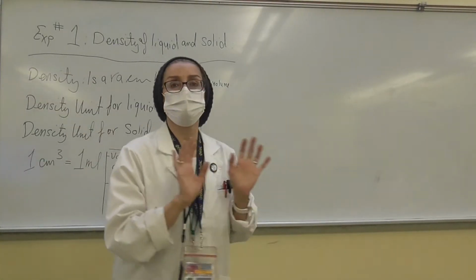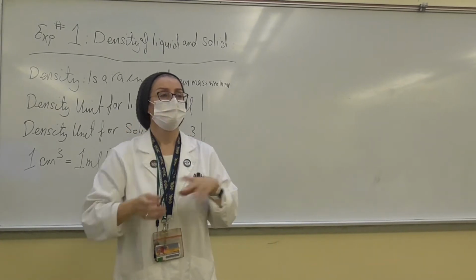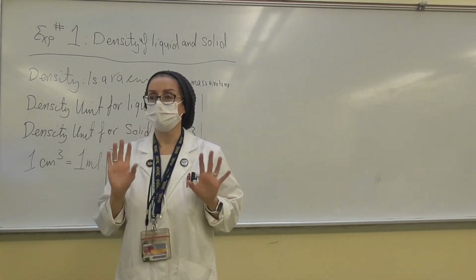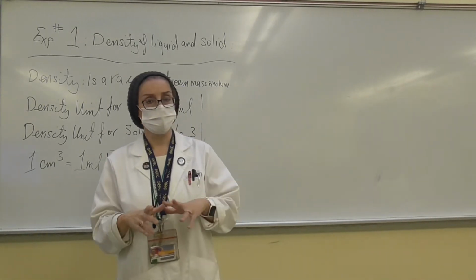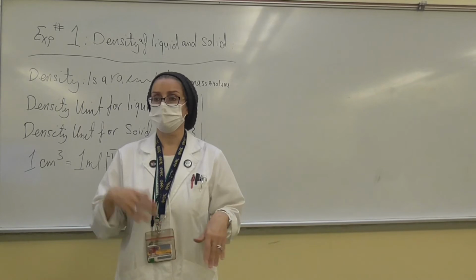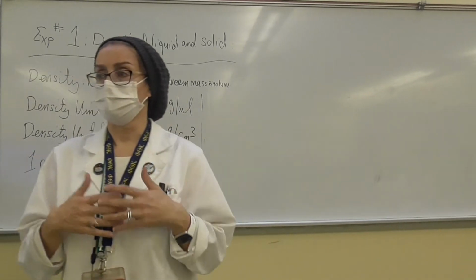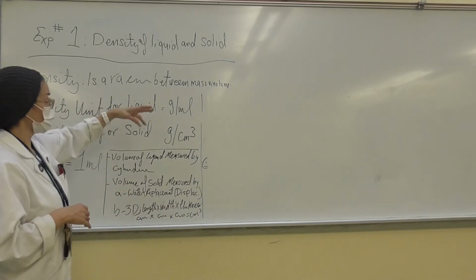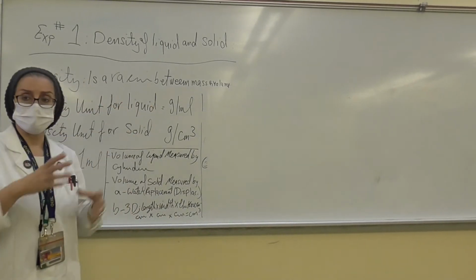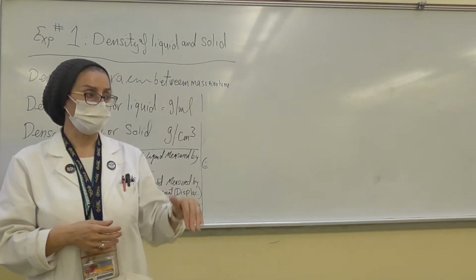So this is what we're going to do today. Please. We are going to have the density. I'm sure we went over it, everybody was there. We went over the density. We know the density is a fraction between the two, which is the mass over a volume.